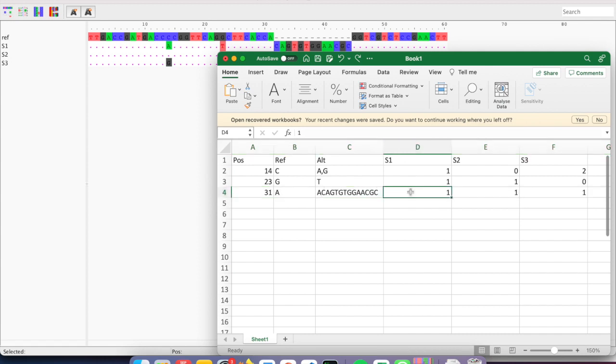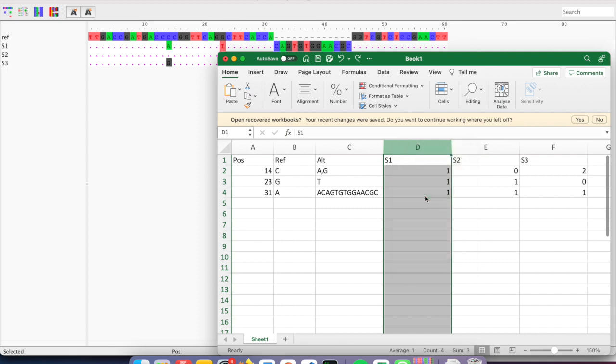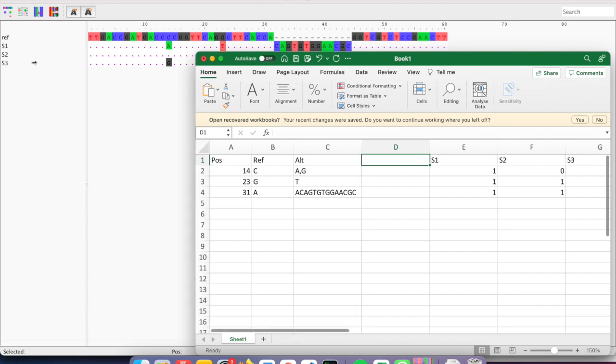You might decide at one point to do a certain kind of threshold of 1 or 2, and then maybe later you want a different threshold. So to avoid us having to look through all of this, what we can do is compute once the number of alternate alleles, and then just note that down as a separate column.